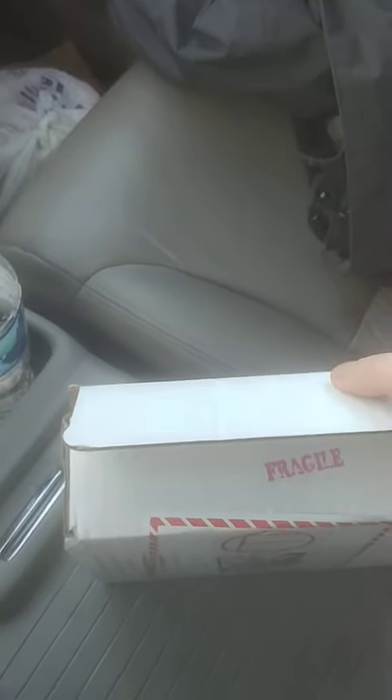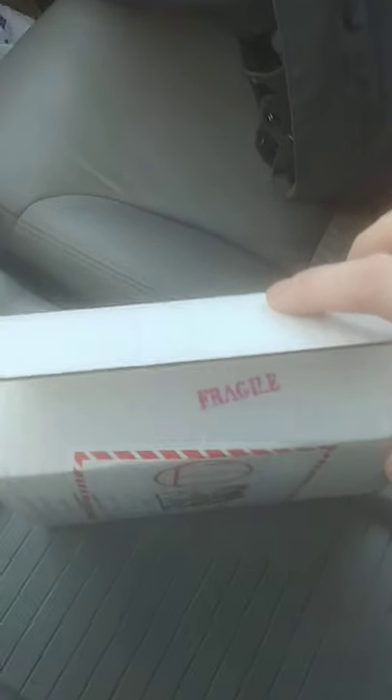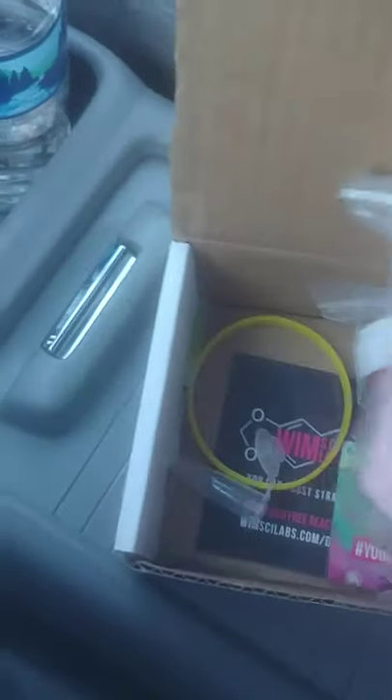Hi YouTube, shooting this video real quick before work. I'm real pumped today. Got a little package in the mail, and this is what we got — a little lab kit.